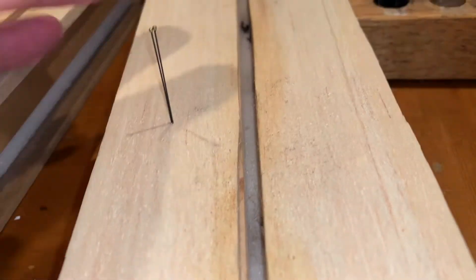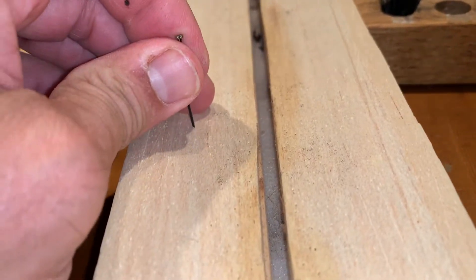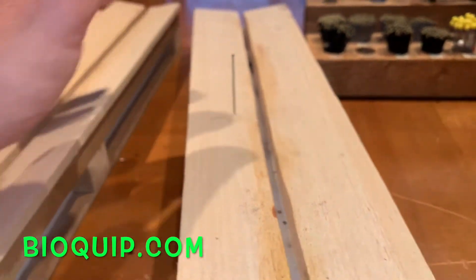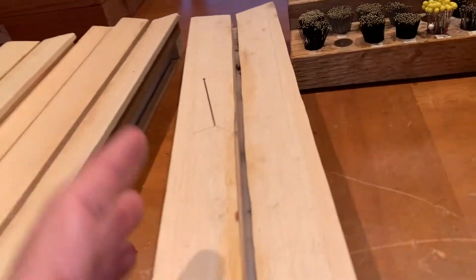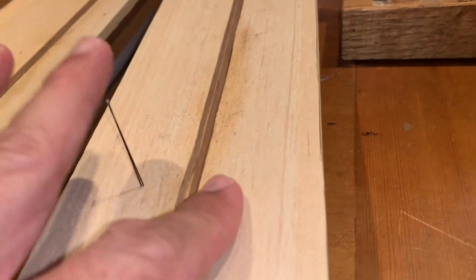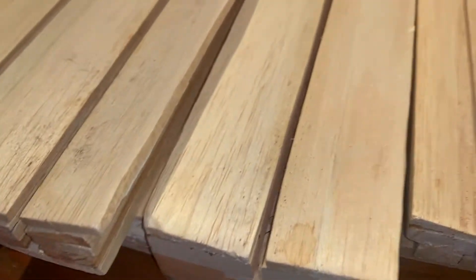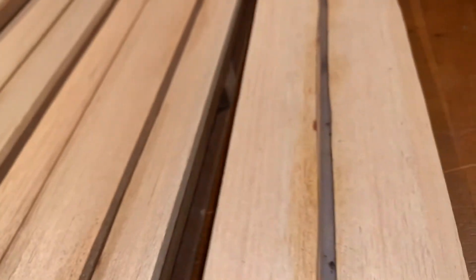You can go to BioQuip and check out their website — it's the place where we get entomological supplies. You can order spreading boards like this; they make theirs out of basswood or hardwood. I like to place a piece of balsa wood on top, and if it ever gets too pitted by pin marks I just lightly sand it off. There are all different sizes of pinning boards, and we'll talk about how to select the right size for your specimens in a minute.